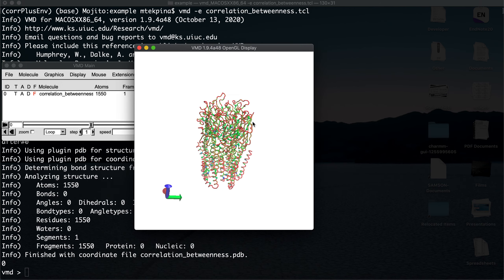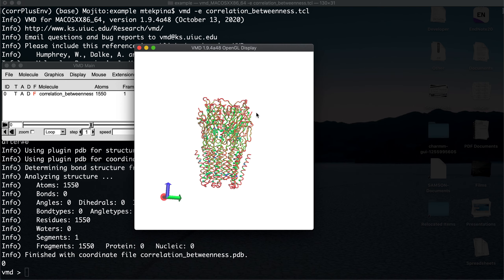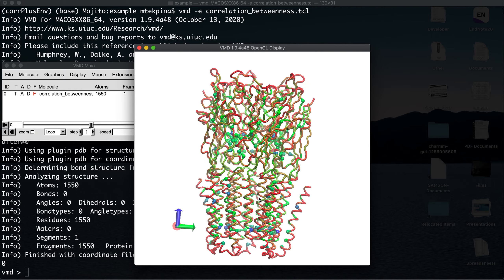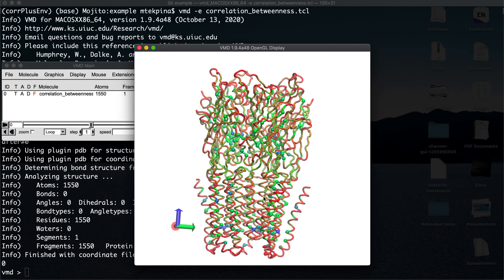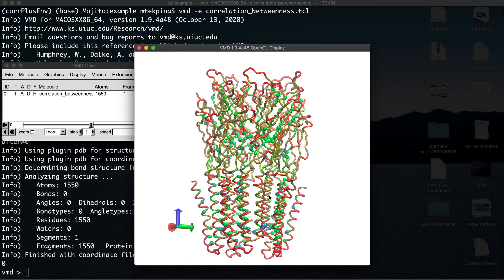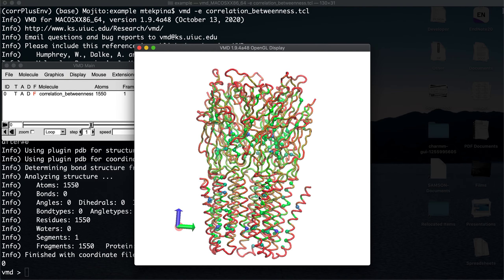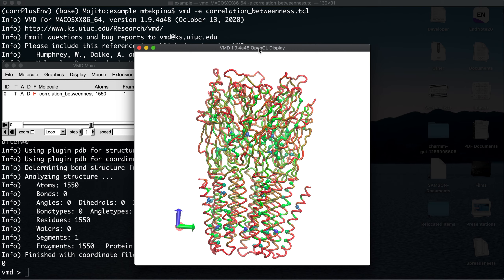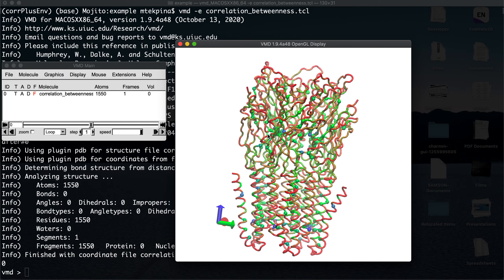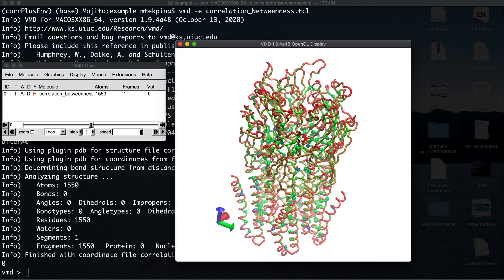Here is the betweenness centrality visualization. It depends on your VMD color scale, but in my scale the blue colors have high betweenness and the red ones have low betweenness. The spheres indicate the residues with the highest ten percent of betweenness centrality.